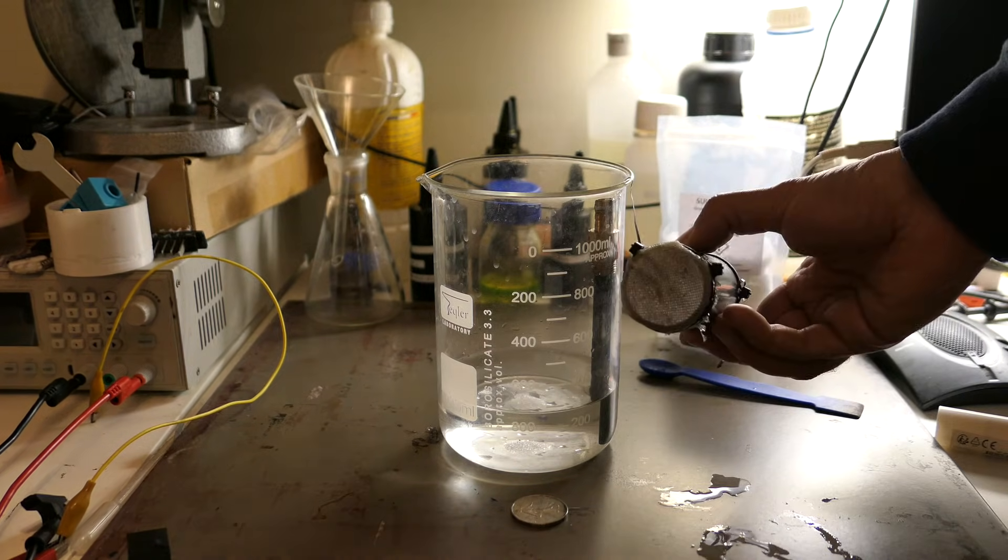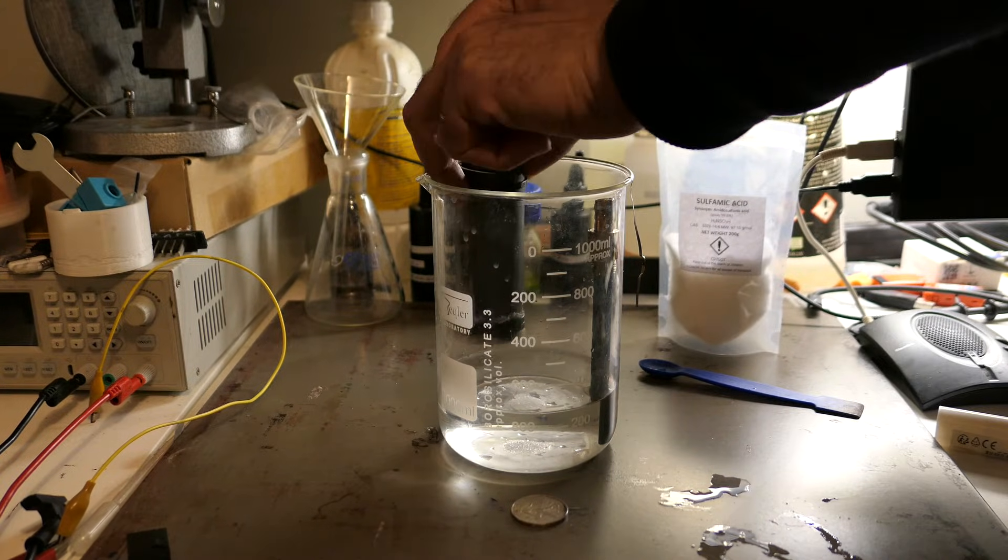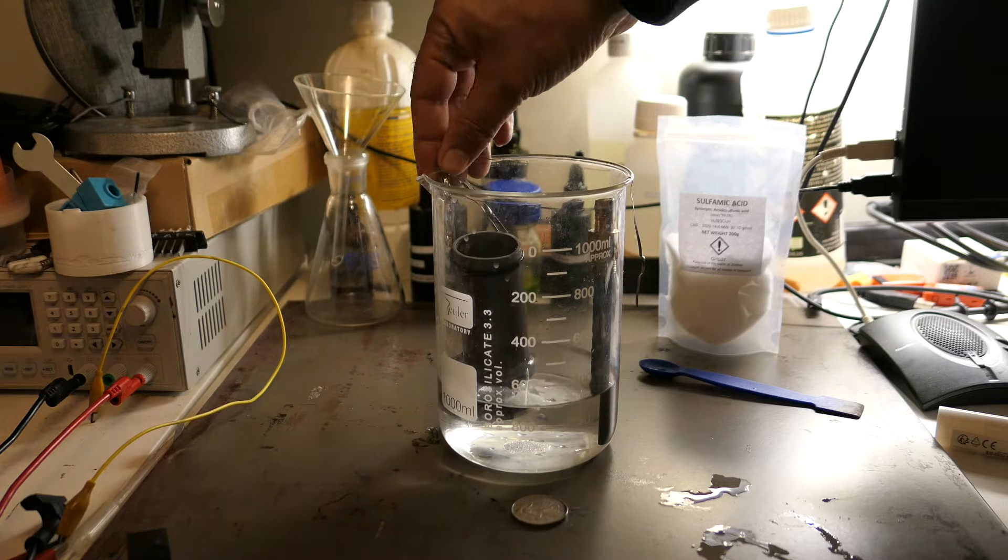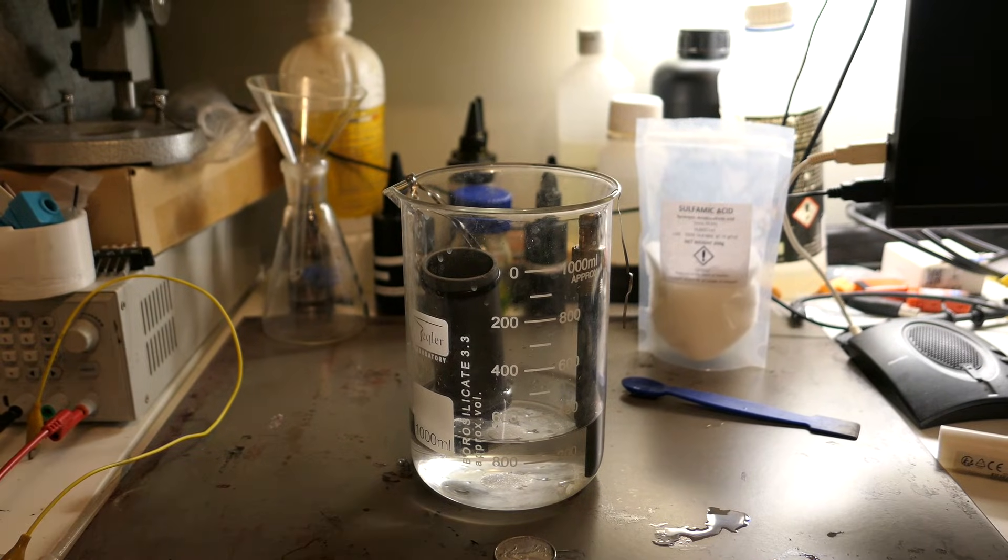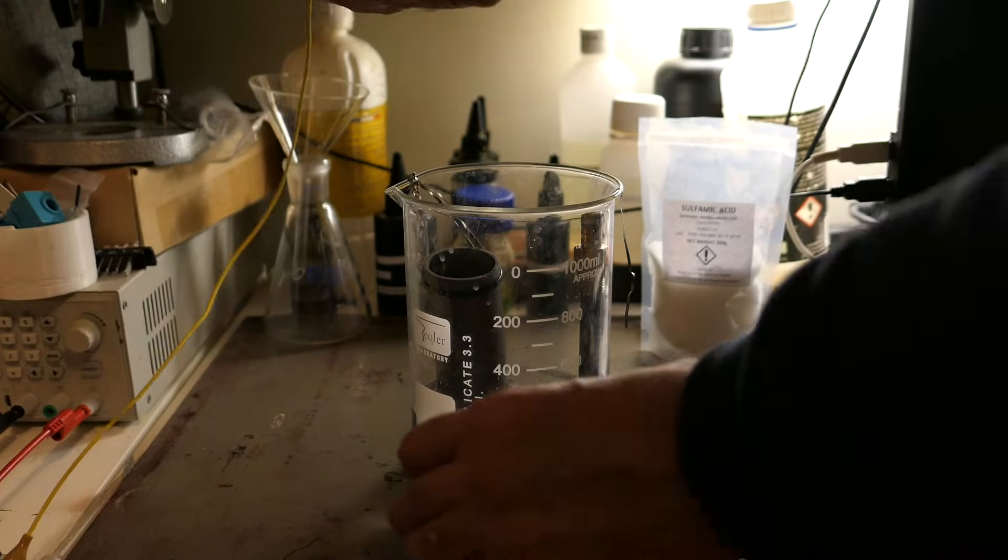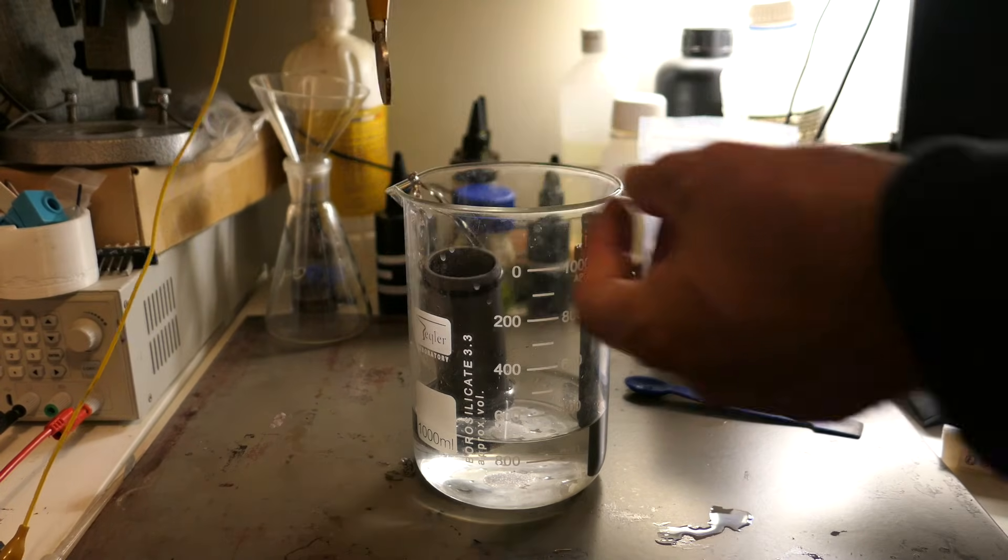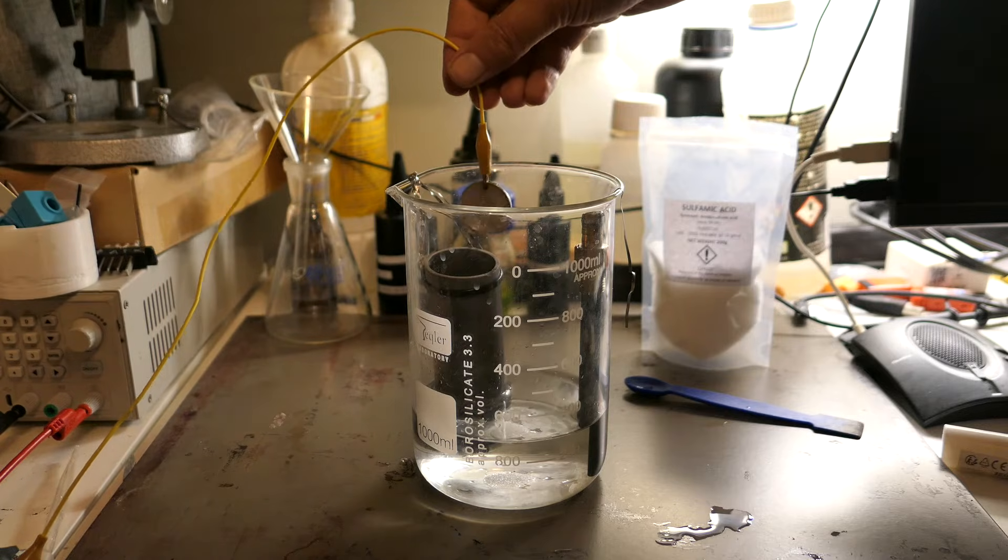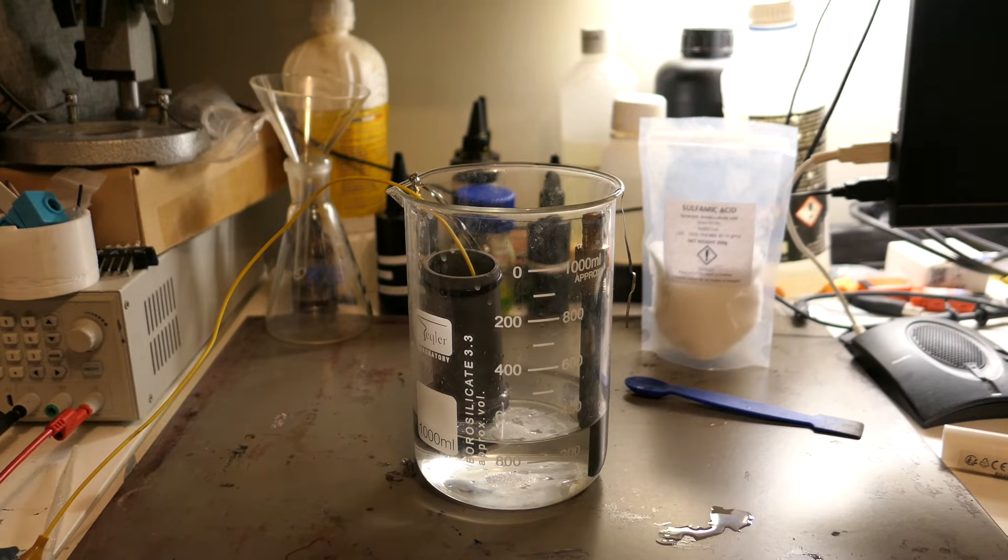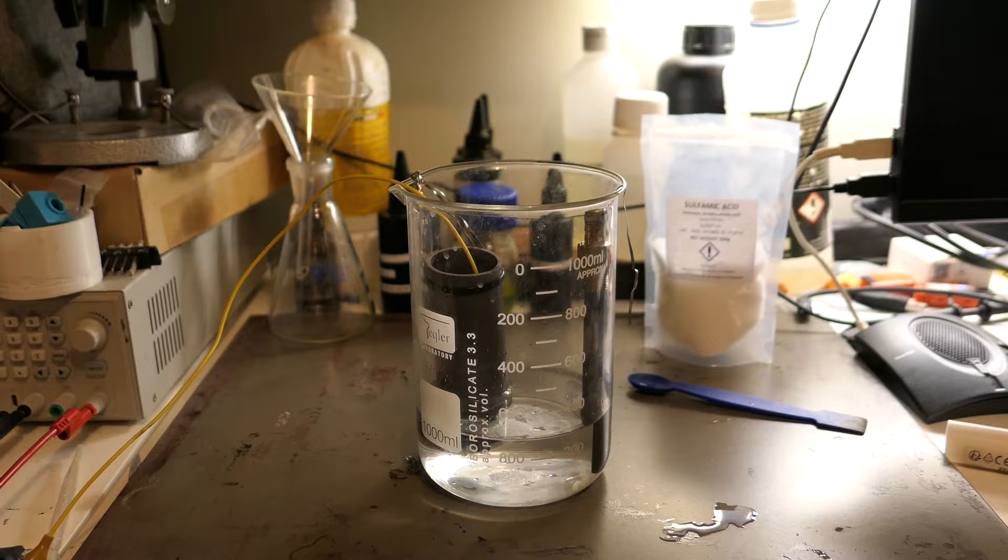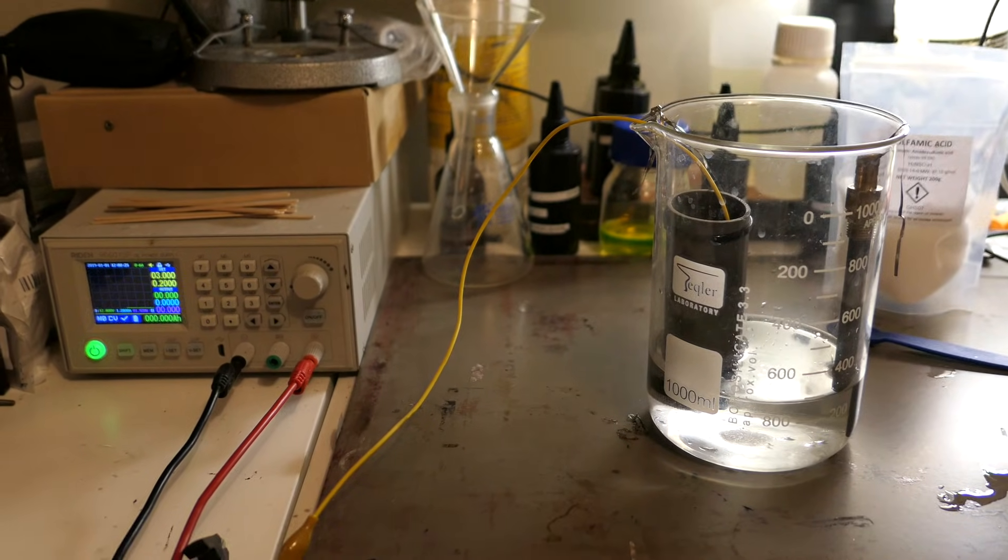Here's how it works. Just like before, the impure silver object is placed at the anode, we isolate it in a tube ended with a cloth to catch any impurities or unwanted metals that may be released. Sulfamic acid serves as the electrolyte conducting the electric current between the anode and the cathode. When the current is applied, silver ions are dissolved from the anode and migrate toward the cathode where they deposit as pure silver. Since copper and other metals have lower reduction potentials, they either remain in solution or get trapped in the cloth at the anode. The result? Clean pure silver at the cathode, without needing any silver nitrate or nitric acid.